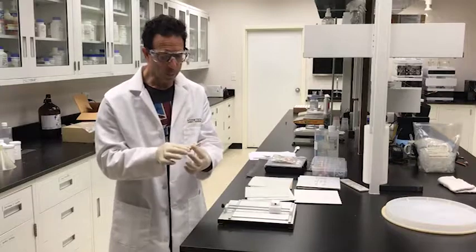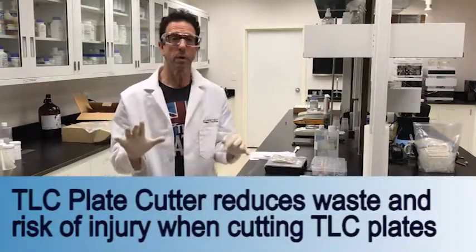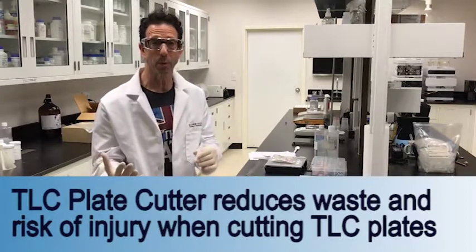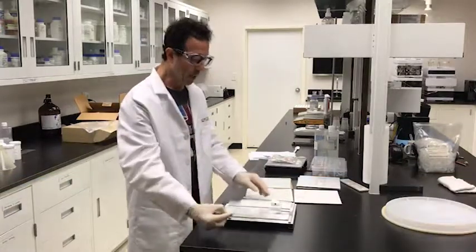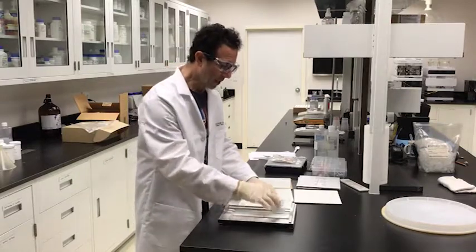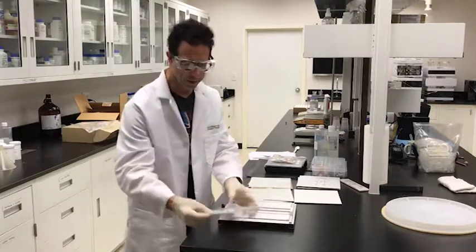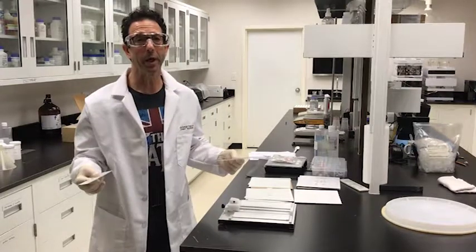The beauty of this versus an old-school glass cutter is you don't break the plate, which is so important. You reduce the amount of waste in the lab and also possibly avoid cutting yourself, which is most important. It's really simple: just take a plate, put it in this little guide, select the thickness, come down with a simple little cut, boom — you're ready to rock and roll.